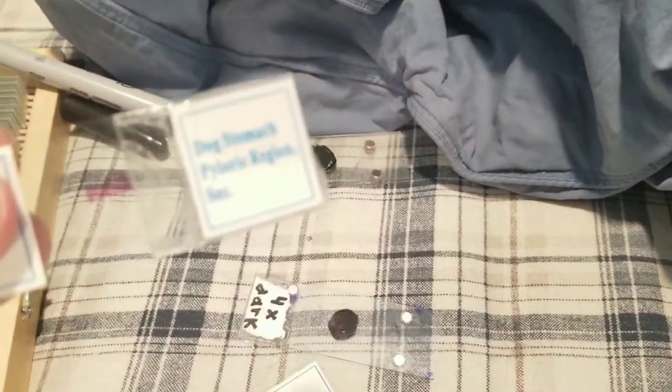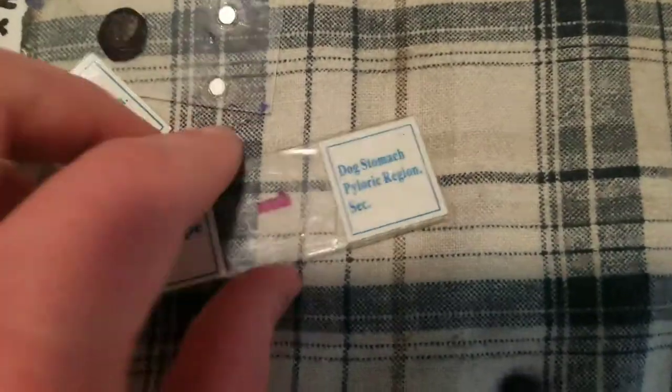Let's try the 4x dark field, and this time I'm not going to use cholera. I'm going to use another sample. This time, the sample is going to be, eeny meeny miny moe, dog stomach, pyloric region.